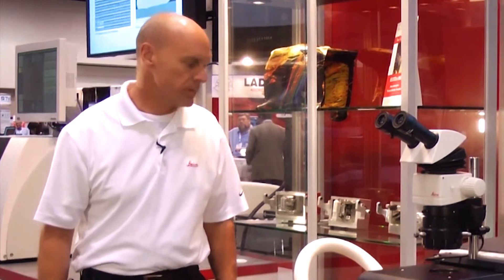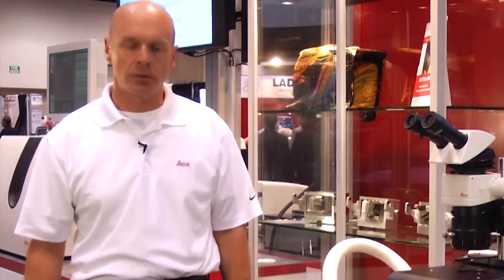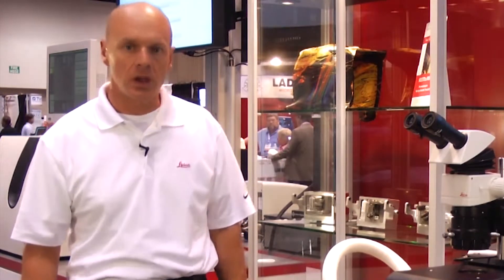We use three saddle field ion beams that project argon against the sample to mill away material in the way of what we want to see with the scanning electron microscope. The ion mill systems are fixed. The sample is placed in front of a mask and everything above the mask is milled away so we can see the slope that's cut underneath it.